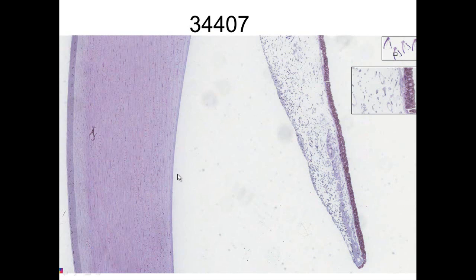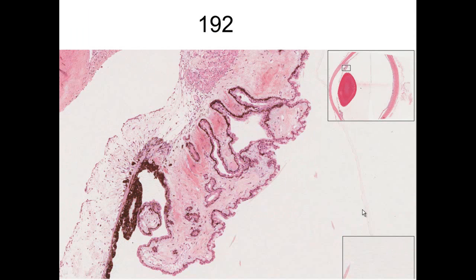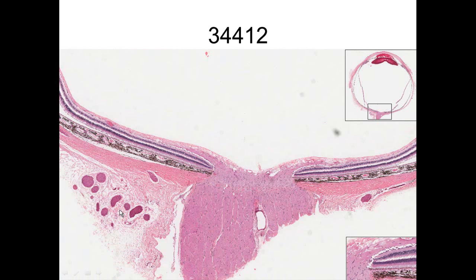The cornea has stratified squamous epithelium on the surface, followed by Bowman's membrane, Descemet's membrane, and endothelial cells at the bottom. The iris and lens are adjacent. Fluid produced at the ciliary processes goes around the pupil and is absorbed back at the canal of Schlemm region. At higher magnification we see the secretory portion and the canal of Schlemm where fluid is removed after passing through the trabecular meshwork.